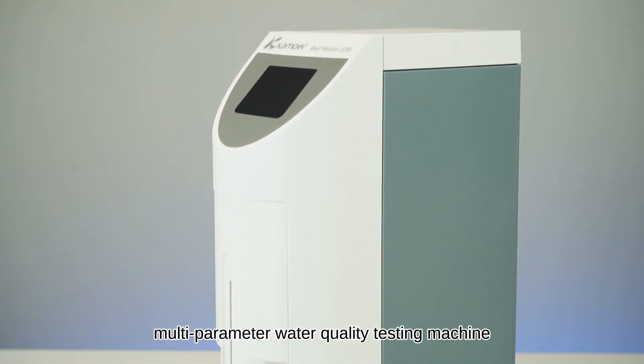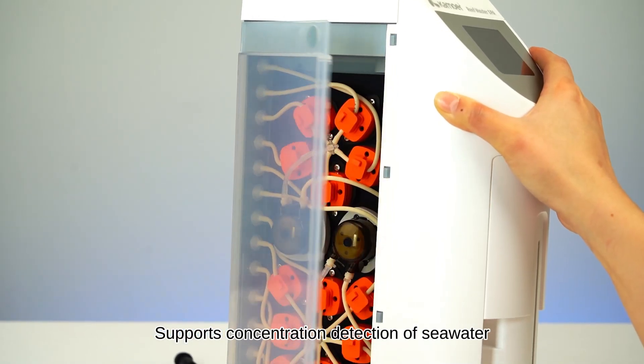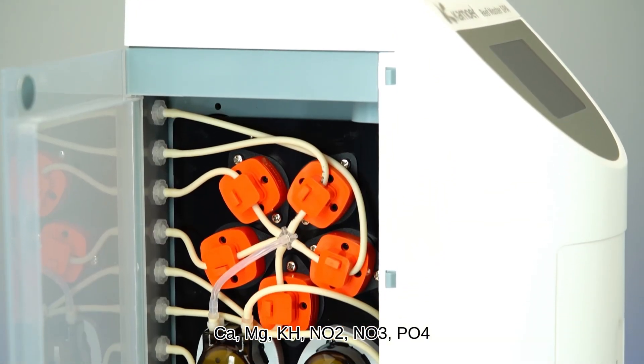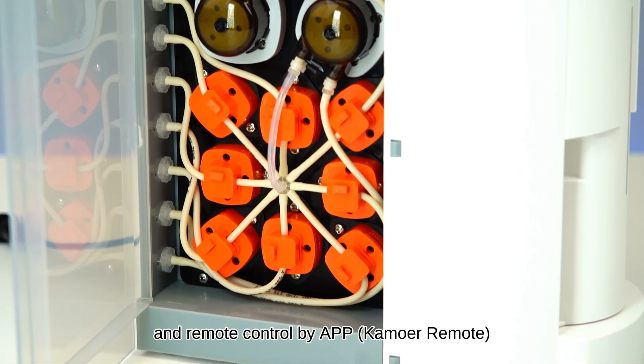ReefMaster SPA, multi-parameter water quality testing machine, supports concentration detection of seawater CA, MG, KH, NO2, NO3, PO4, and remote control by app.